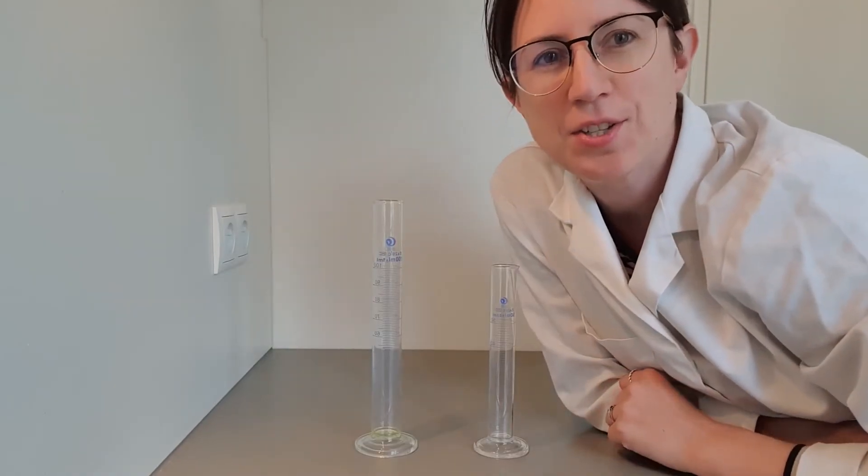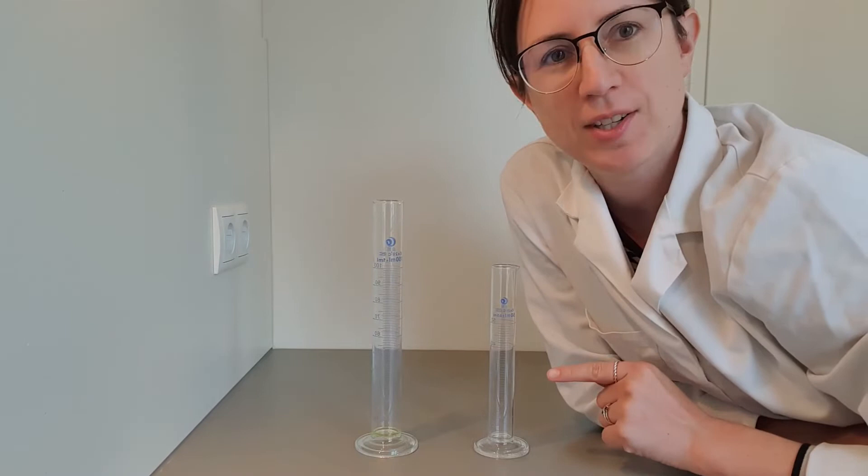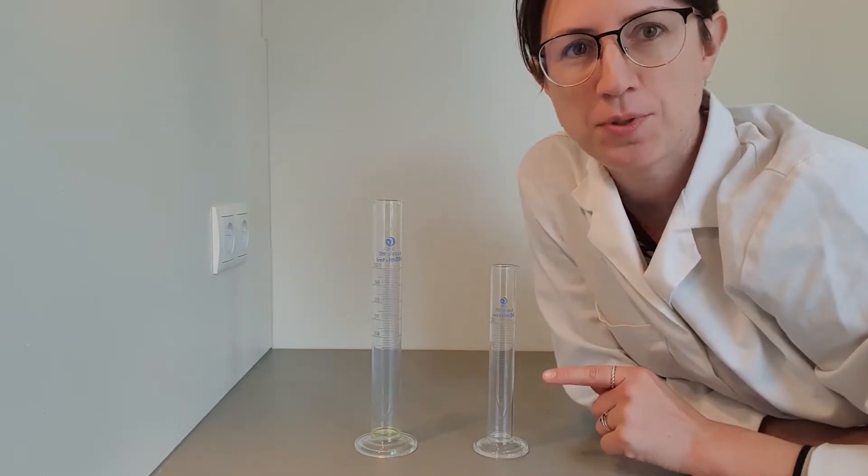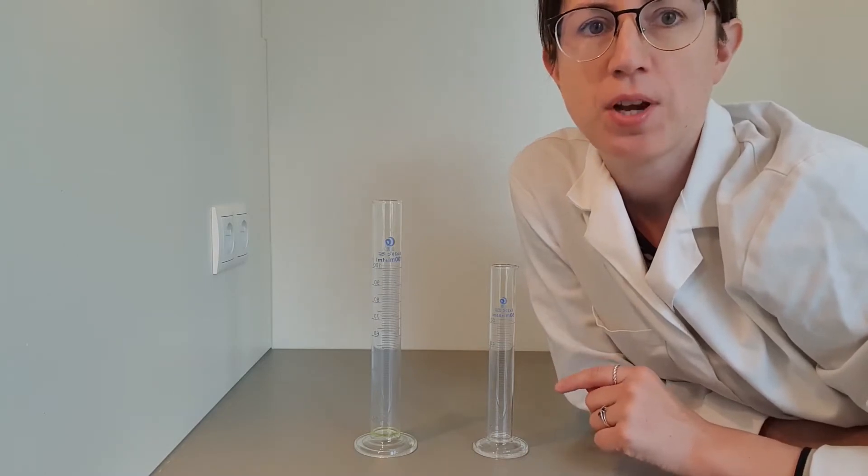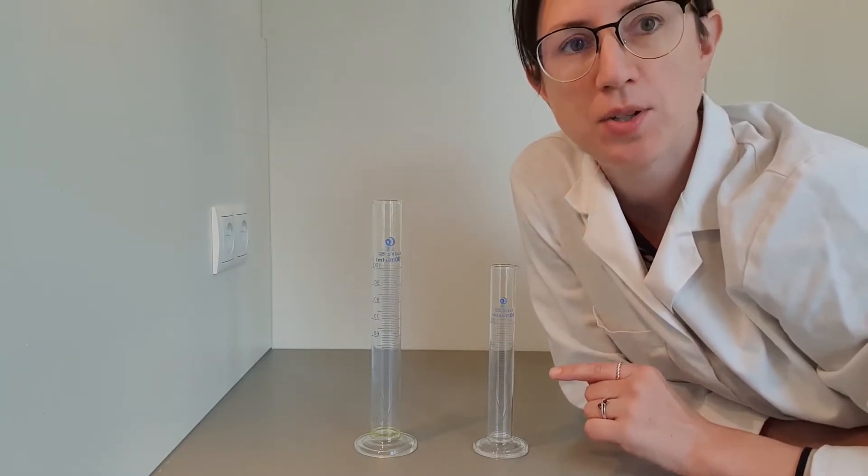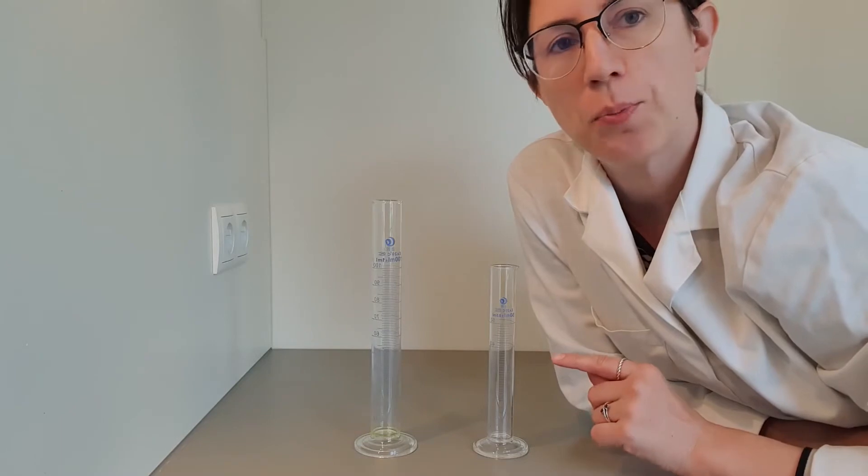Now, as every good scientist knows, we use a measuring cylinder to measure volumes, not a beaker, because measuring cylinders are more precise. They're not the most precise measuring instrument, but they are a lot more precise than a beaker.